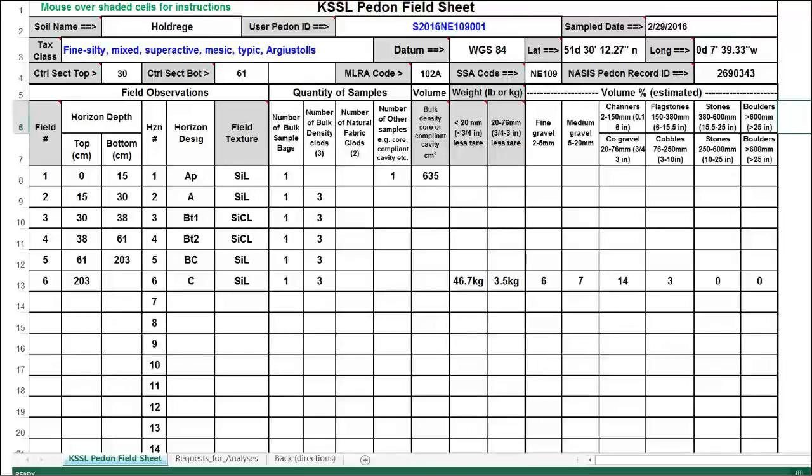Okay, there are some soils where we are unclear if there's enough fiber to be an O-horizon. Would it make more sense to request fiber count, PSDA, or both? For ones where you're unsure of the amount of fiber, what we would probably do here is run loss on ignition and take a look at the results from that and decide whether to run fiber or run PSDA. The loss on ignition, incidentally, shows up in that form as mineral content or something. It's the column to the right of fiber.